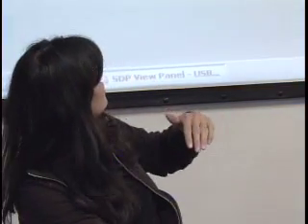All right. So next, we want to do this roundtable discussion, and it doesn't have to be in this whole order because I'm sure they'll all be intertwined at some point. But validation, I think, is what some people are thinking of next. And I know Kelly even had written down some issues that may pertain to validation. Well, I think a lot of mine are QC issues, and like I said, casework considerations. But as far as validation, Christine and I were talking about this. Okay, there's developmental validation and there's internal validation.